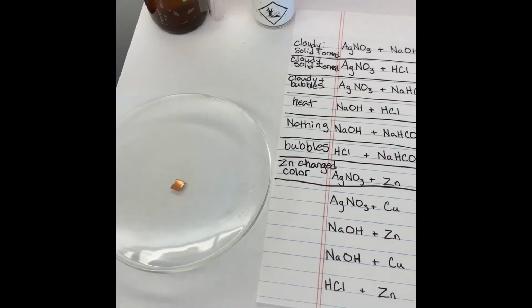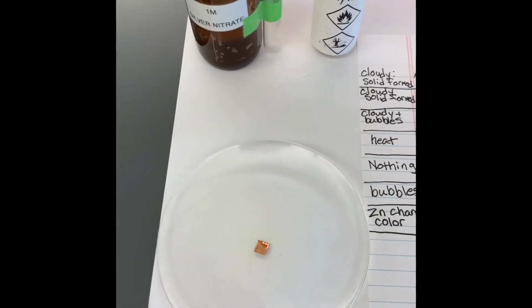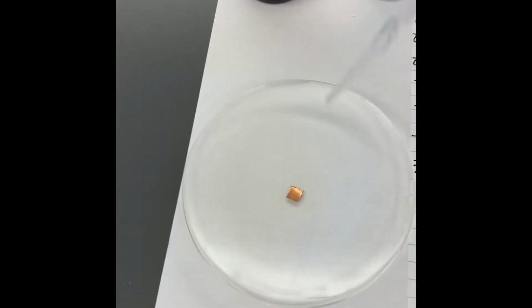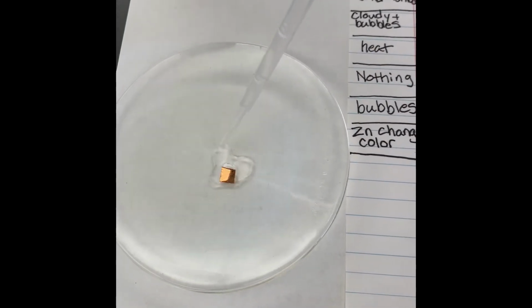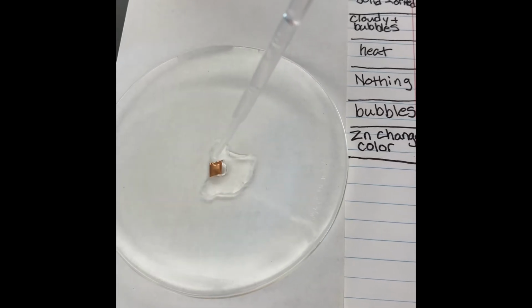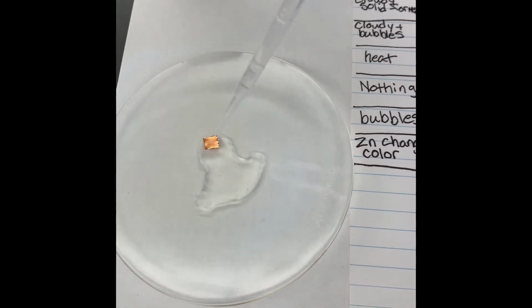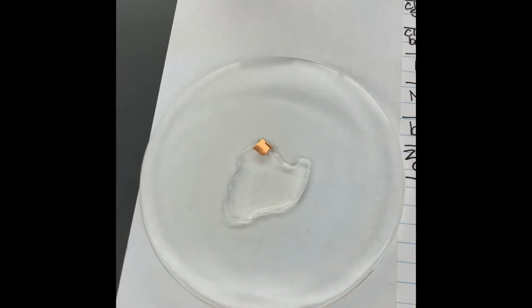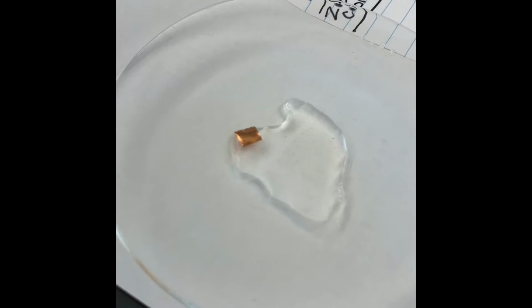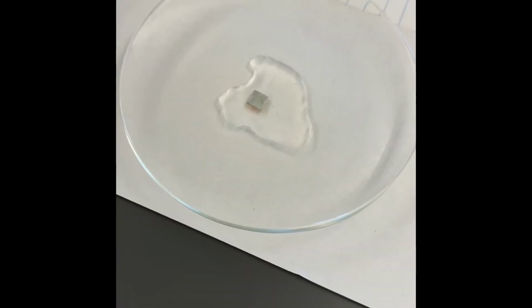Now we have the copper foil and the silver nitrate. Well, this is quite different.